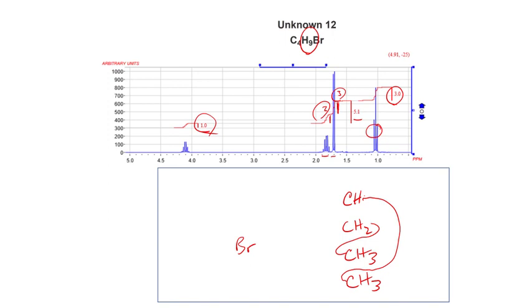Because basically, I have CH2. If I were to connect that to the Br, I just finished a little molecule called ethyl bromide and left another chunk that isn't finished. So I can't do that.